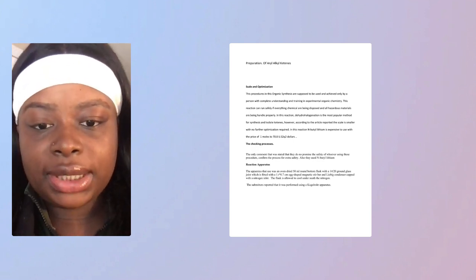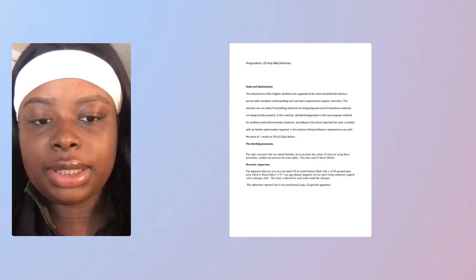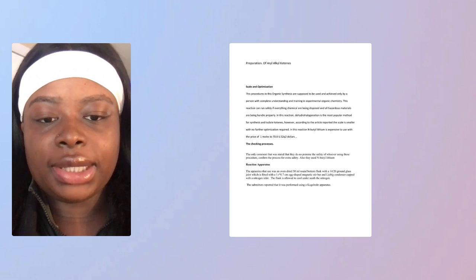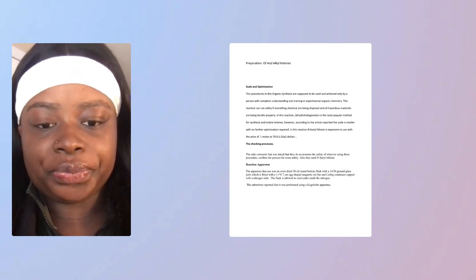In the checking process, the only comment that was stated was that they do not promise the safety of whoever uses this procedure; confirm the process for extra safety. Also, they use N-butyl lithium.